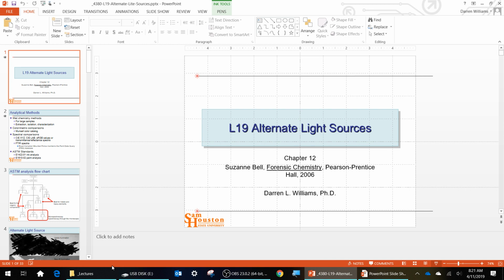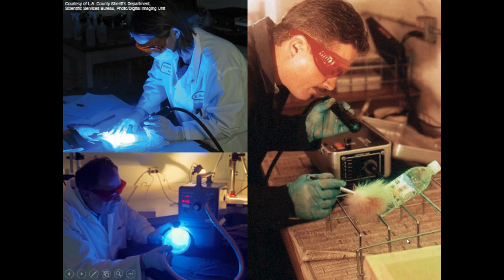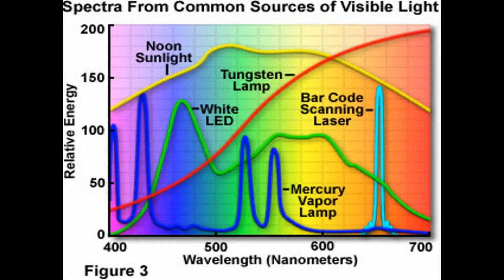Okay. If you have fingerprint oil on a surface, you can dust it, and then that fluorescent powder sticks to the oil and gives you good contrast for the fingerprint. Then you shine one of these lights on it and take your photography. You develop the photograph and then look at the ridge patterns to make a match. Or an exclusion. So that's the point of this alternate light source. It's trying to find evidence and better characterize evidence.